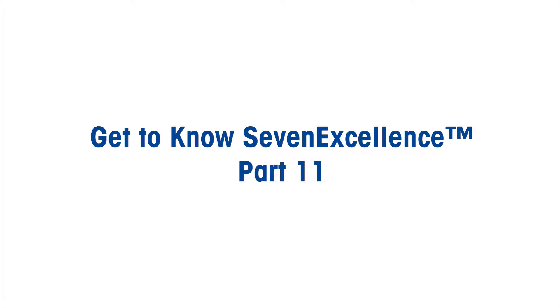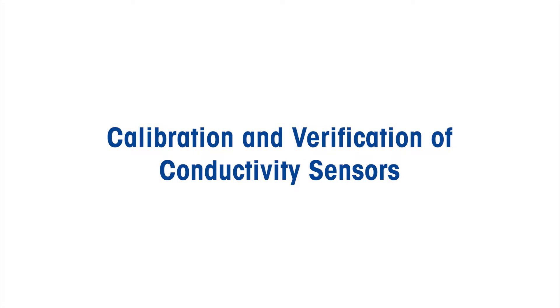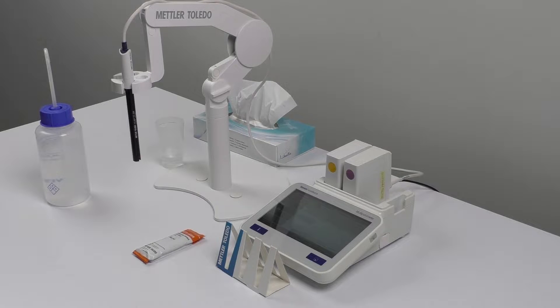Welcome to the video 'Get to Know 7 Excellence, Part 11.' We're going to walk you through the calibration and verification of conductivity sensors. Let's consider the calibration of the InLab 731 ISM sensor, which comes with a nominal cell constant. It's super important to calibrate the sensor with the 1413 microsiemens per centimeter standard before its first use.